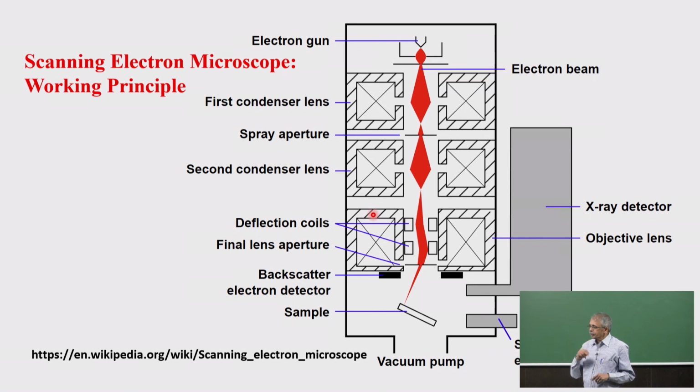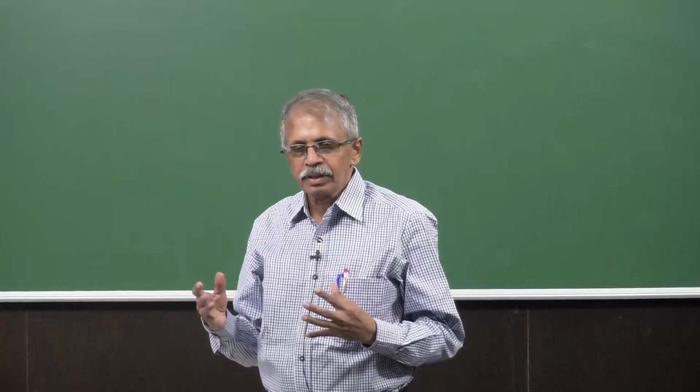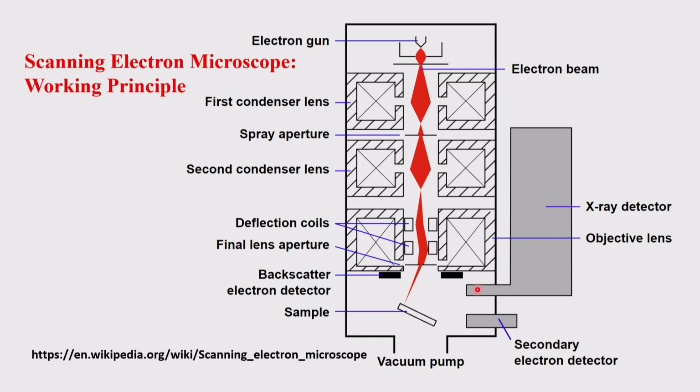Just now I mentioned that you can have different kinds of detectors to measure the secondary electrons, the backscattered electrons, etc. Just look at the principle.